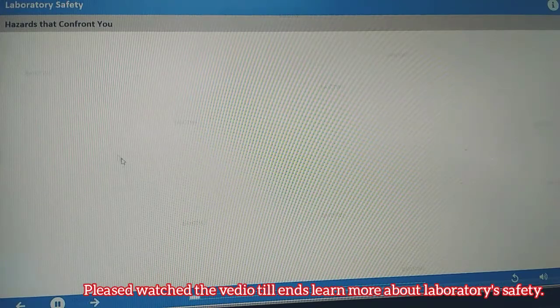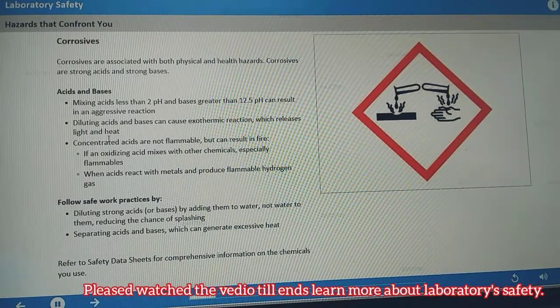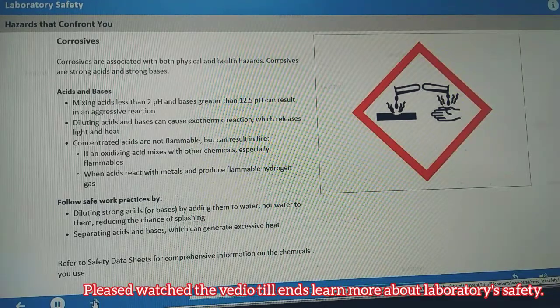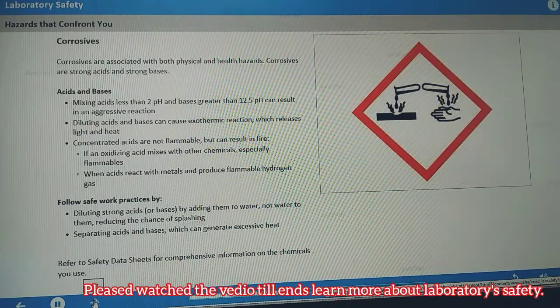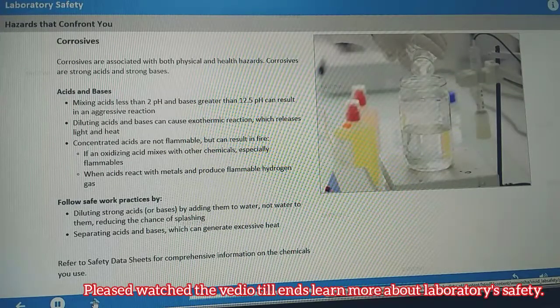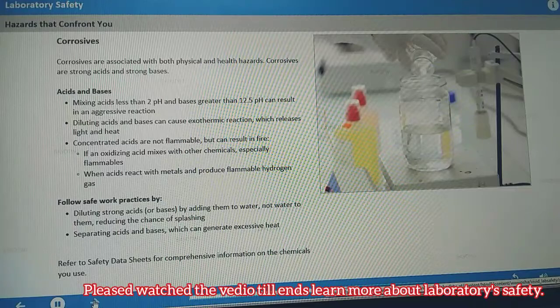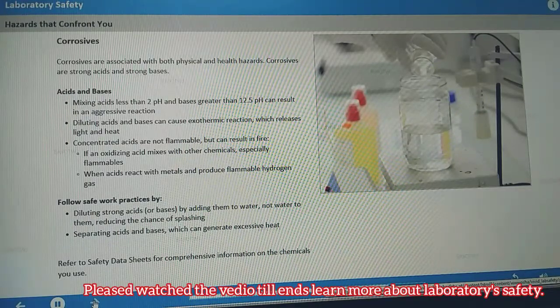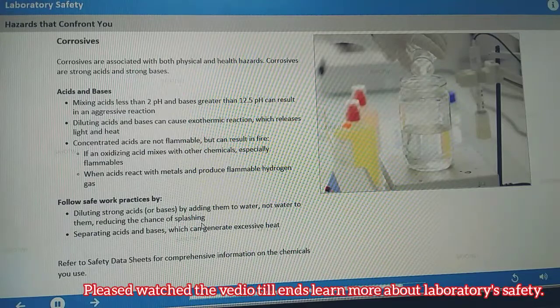Some chemicals are associated with both physical and health hazards. Corrosives are in that class of chemicals — they are strong acids or strong bases. Acids and bases are incompatible, and mixing them can result in an aggressive reaction. Avoid exothermic reactions by diluting strong acids and bases by adding them to water instead of adding water to them. This reduces the chance of splashing. You'll also want to separate acids and bases because they can generate excessive heat.